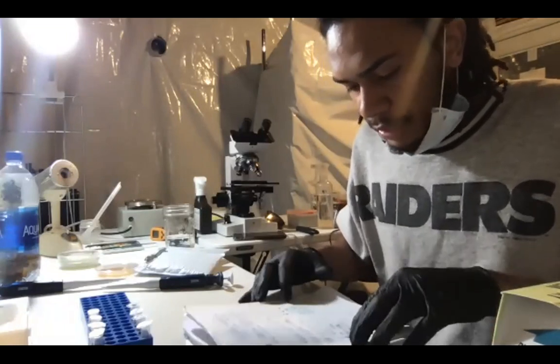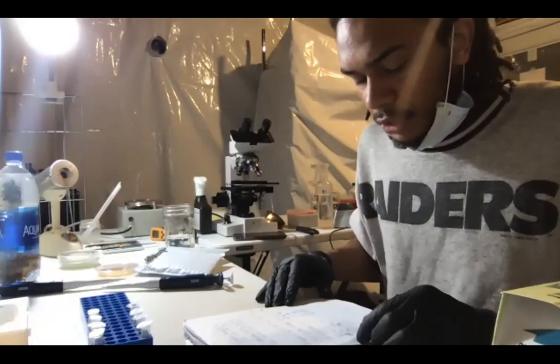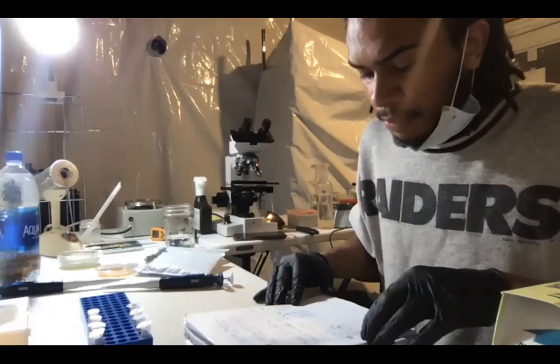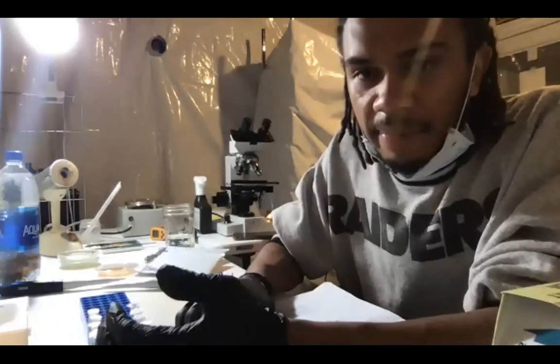So at the end, I'm going to need 76 microliters of water, 100 microliters of master mix, 8 microliters of forward primer, and 8 microliters of reverse primer. So that's what I need in total. My apologies, I'm really bad at math.